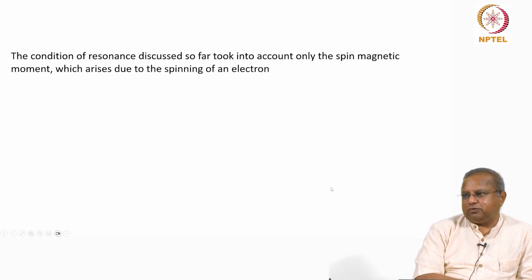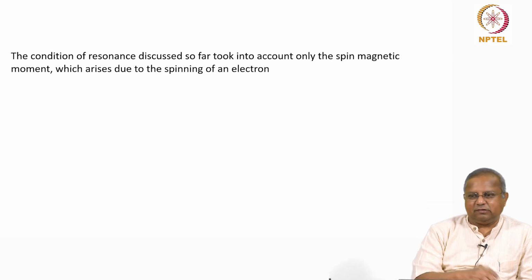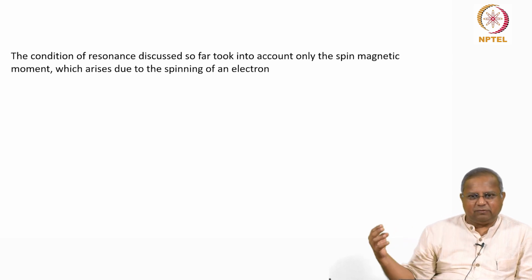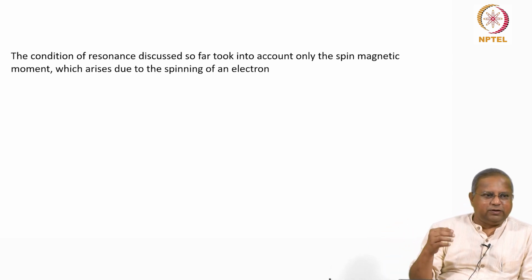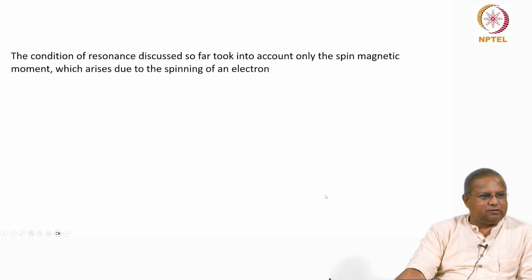Okay, fine. So when the energy matches, the principle is simple. When energy matches, there is absorption. When the difference in energy level matches with the energy that's provided, there is a jump, right? The electrons jump from the lower energy level to the higher energy level, and that energy is measured and processed to get information.